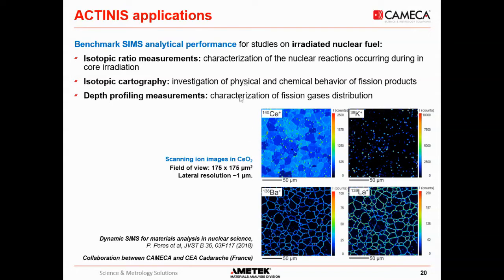So we can see that on the cerium image, we can distinguish the different grains. Different colors, in fact, correspond to different intensities from the different grains due to the different crystallographic orientation, giving a slightly different response.